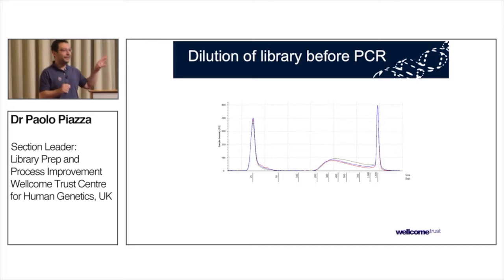The other thing is that we didn't dilute the DNA to get to these results. We actually added more or less enzyme. And this was easily achievable because we delivered the enzyme with the Echo. Because this is not RNA, the amount of material is unlikely to impact the results in an unpredictable way. We are happy to use as much of the DNA as we can within reason in the prep, and we can do a decent job by adjusting the amount of enzyme we use.